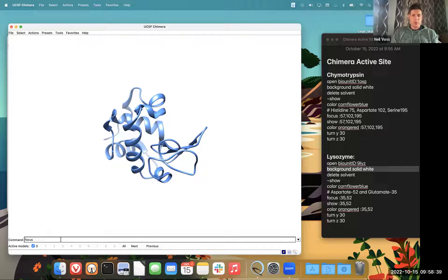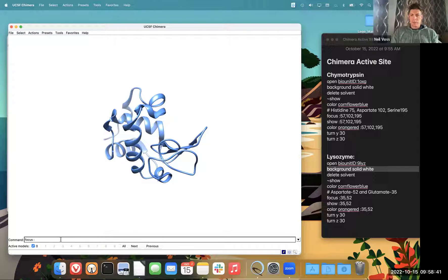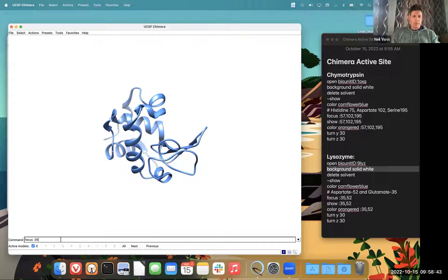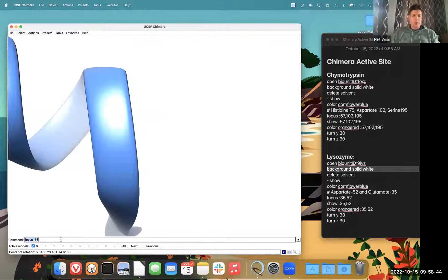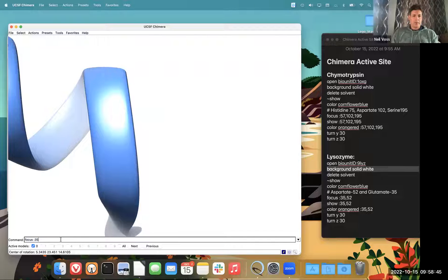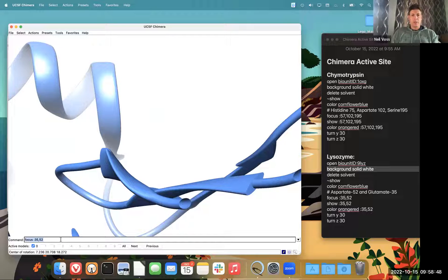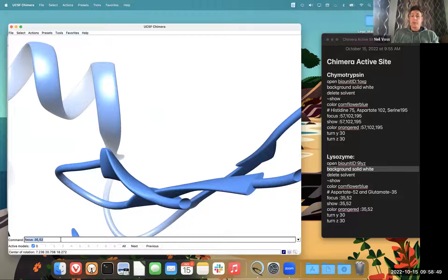So if I type in the word focus colon and then type in an amino acid number, it will zoom in on that. If I do colon comma two amino acid numbers, it'll zoom in on both of them. Notice they're not being shown right now.